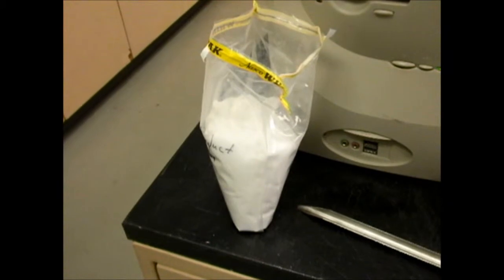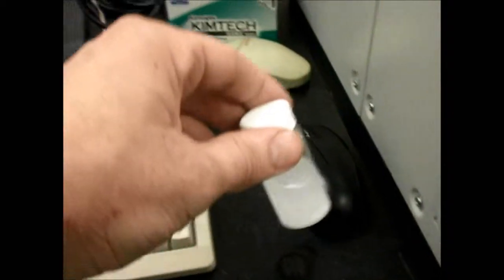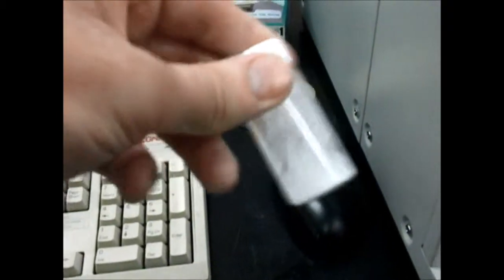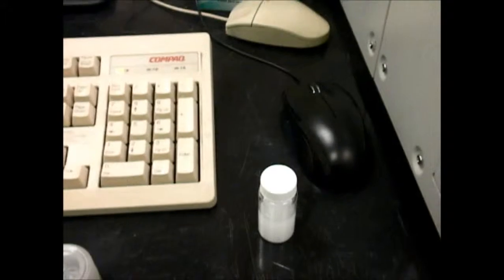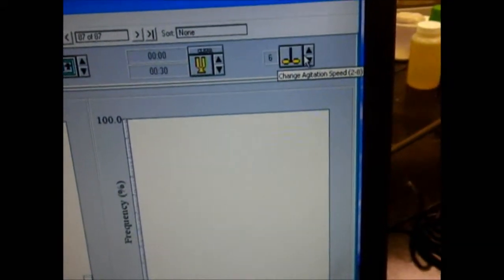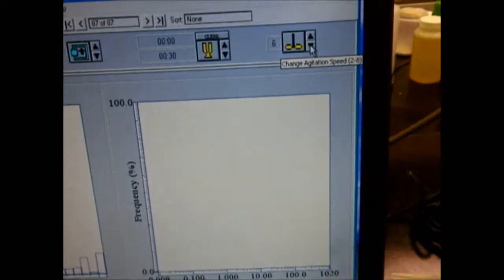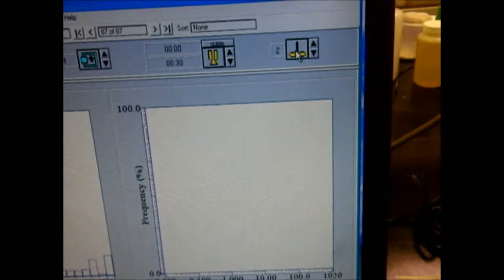I've created a sample and I've got it right here. What I have done is predispersed it — meaning I've put a certain amount of sample into the solvent, in this case IPA, and shaken it up. The sample should look like this. Now I'm going to start agitation of the sample using the ultrasonic and agitation controls on the instrument, starting at a low agitation of about two.